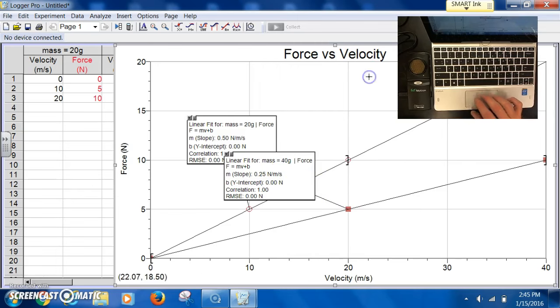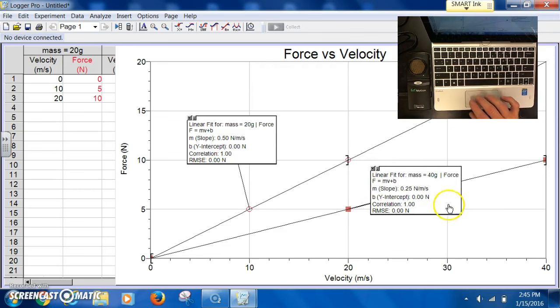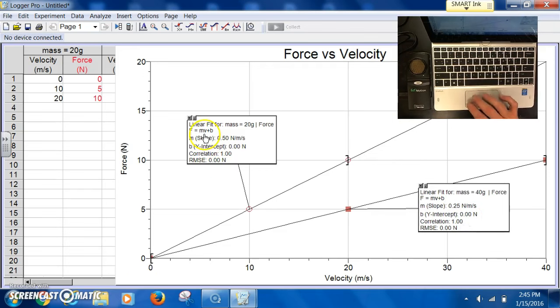Look at that. Let's make sure we don't have that gray area. It's just wasting when you print it out, so make sure you click the graph before you print. And you go over here, slide this around, and now you've got both text boxes nice and pretty. You get your slope, and you might be really close to being done with the lab at that point.